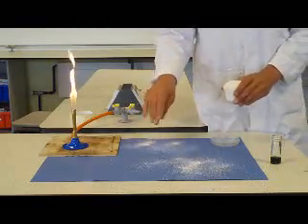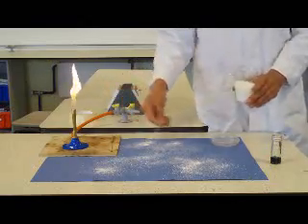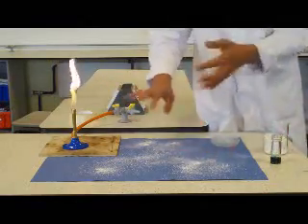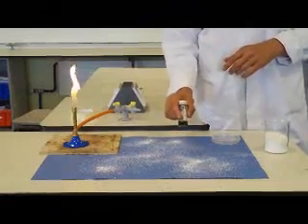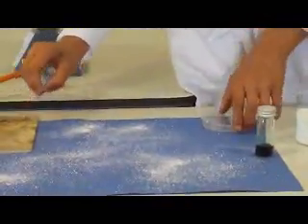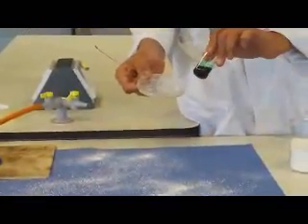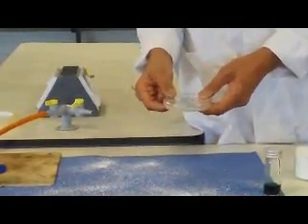For example, soap. This represents the environmental bacteria that we don't want to get onto the agar plate. And when students first attempt this, I use green dye or ink to represent the bacterial culture. In that aseptic technique, the key point is to make sure that only the culture ends up on the agar, and that none of the potential contaminants end up on the agar.